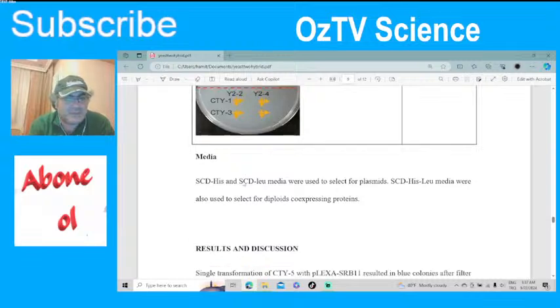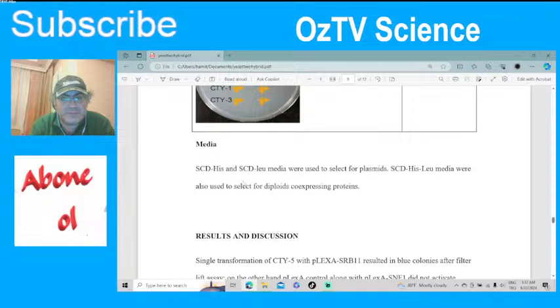Synthetic complete media was used to select for plasmids. Another media was used to select for diploids, because once you made the haploids and now you have a different combination, prototrophy changes. This was another complementary media, synthetic complete media missing histidine and leucine. This is more challenging: this one is only missing histidine, this one is only missing leucine.